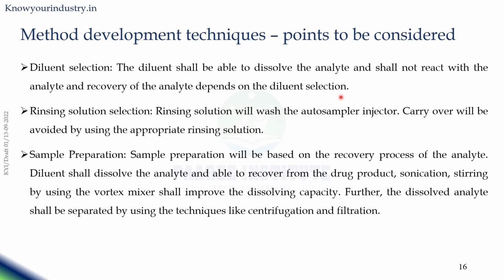So the diluent you select is very critical for the method. Then you also have to choose the rinsing solution to avoid carryover during the method. This rinsing solution will wash the autosampler injector every time a sample is injected from the autosampler.